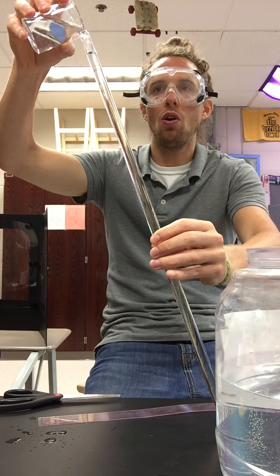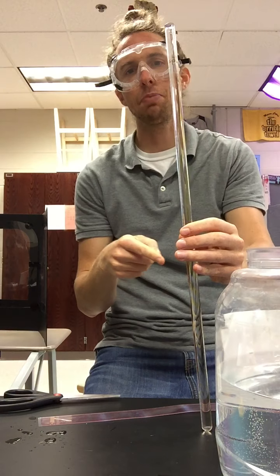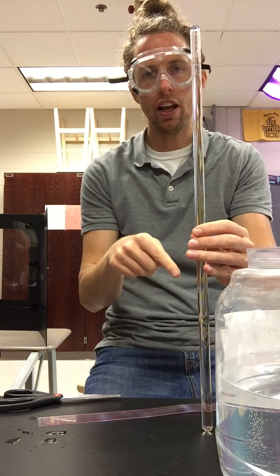I'm going to fill this thing up the whole way to the top, so that when I put my stopper in, I actually displace some water, because I want to measure all of the gas in here.